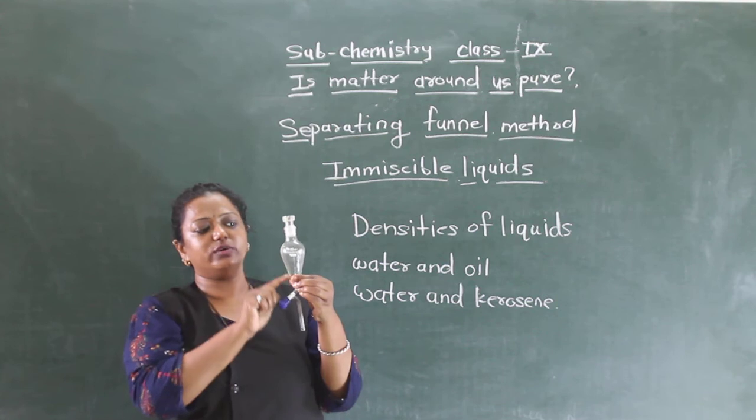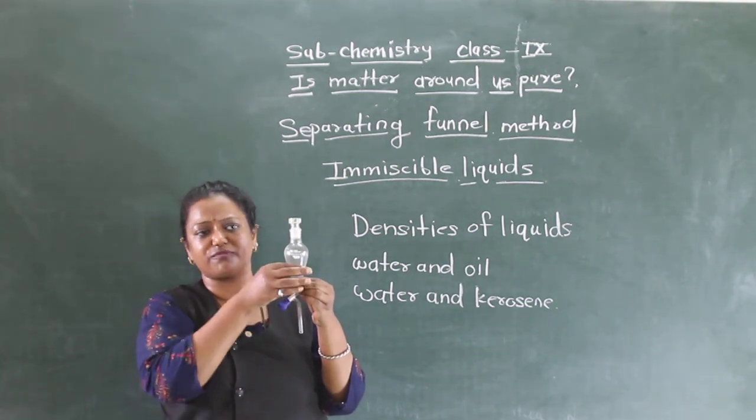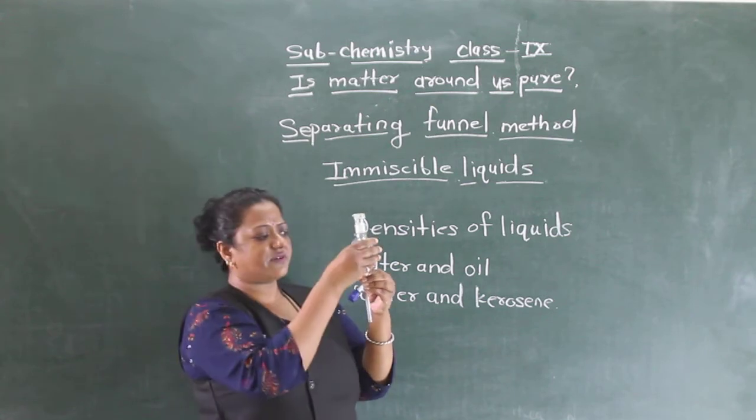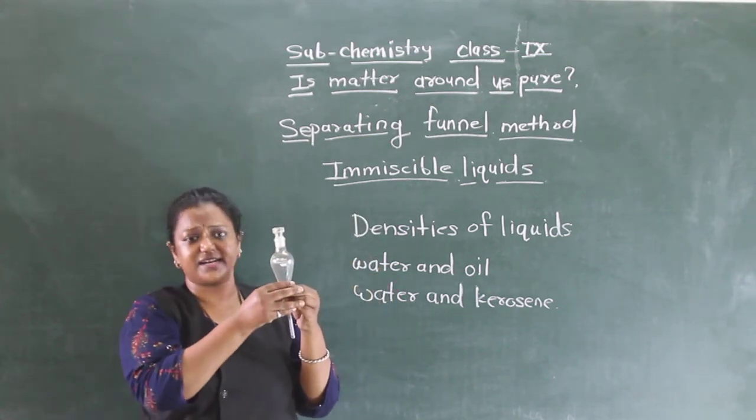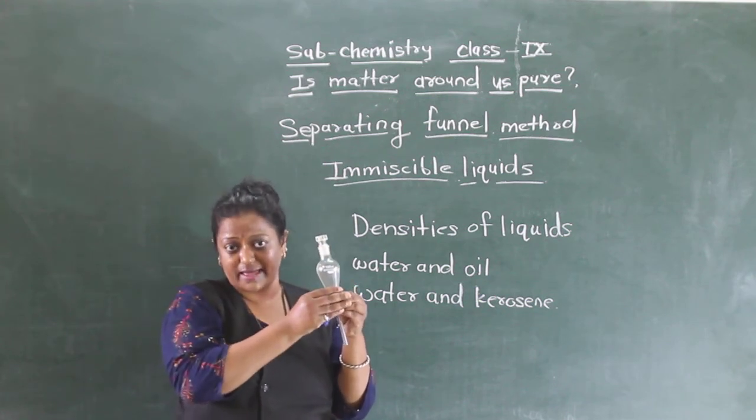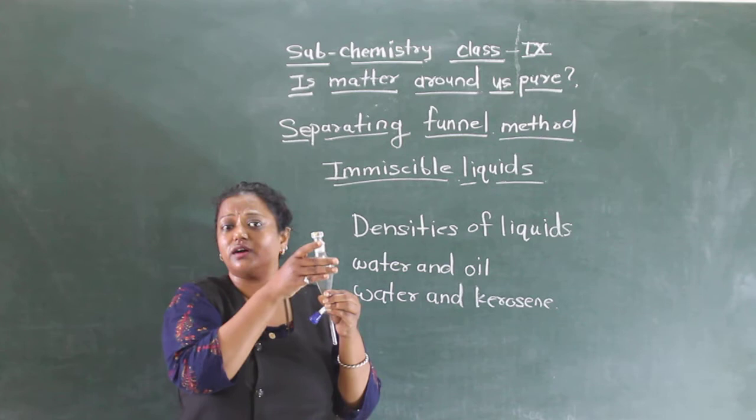Then we can easily see two different layers of oil and water as I said. Here also you can see—sorry—first water is there and above it the layer of oil is there.